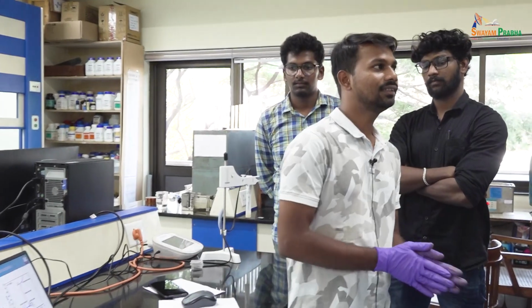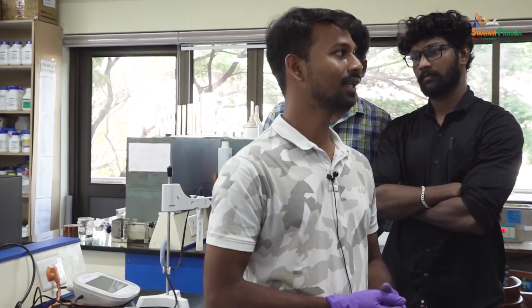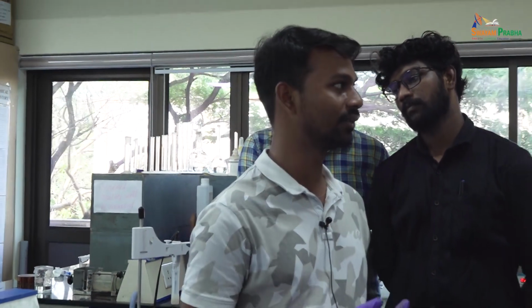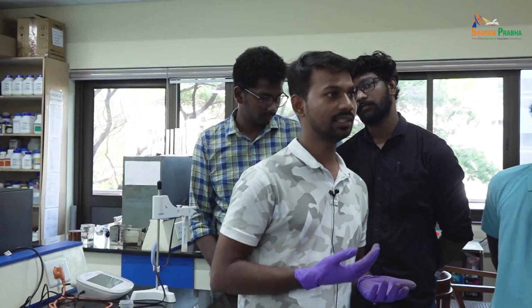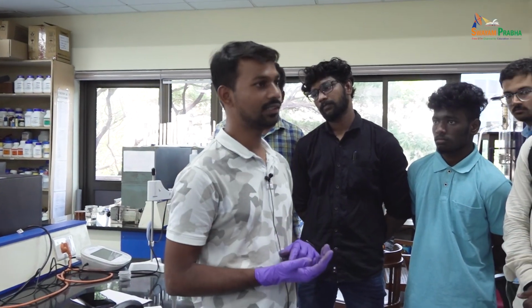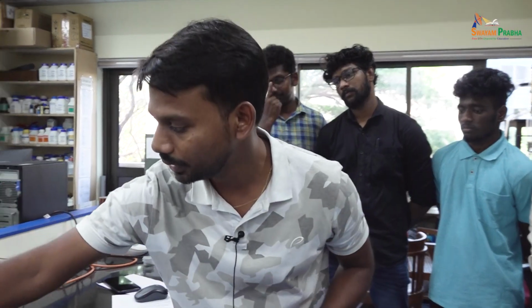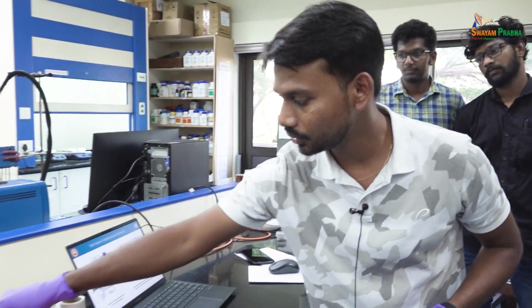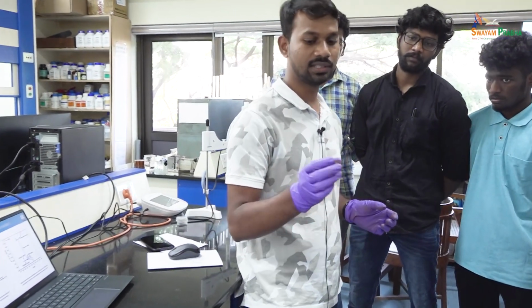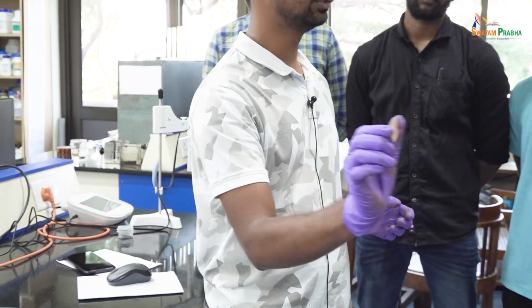Good afternoon everyone, welcome to the lab session again. I think you have got enough knowledge on what PDP is, how to do it, and how to find E-corr and I-corr for a material. Yesterday you saw it for aluminum. Today we will see how bronze performs in seawater solution and acid rain solution. This is the bronze sample that we are going to use.